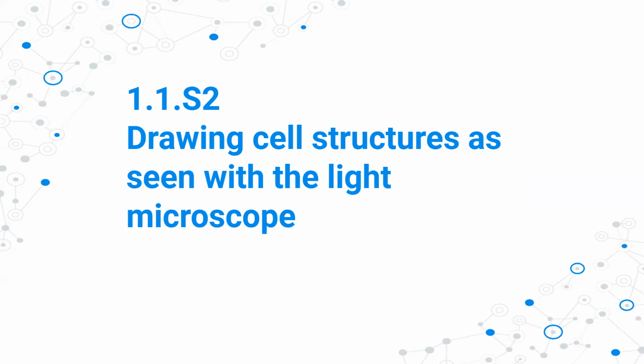I'm going to bring you paper because I want you to actually work it out and show me what you've done. Let me give you an example. On a piece of scratch paper, you'll put your name or your names if you want to work as partners. You'll have a drawing, and maybe you want to measure this cell that looks like a star. You're just going to draw it. It doesn't have to be beautiful. Give me a little sketch of what you're measuring.